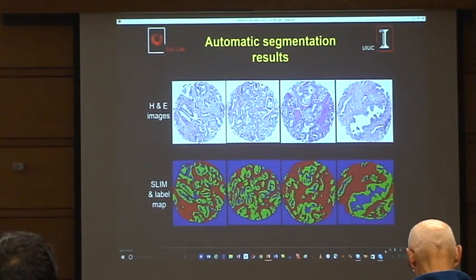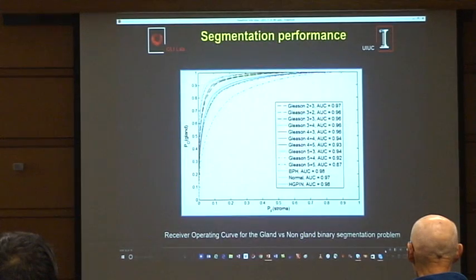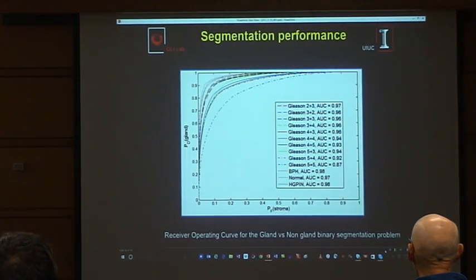So we're trying to kind of do the same thing. So it takes a long time to teach the computer what these slim images look like, and hopefully at the end we have very fast testing. Here is where we are. So segmenting is the first problem.